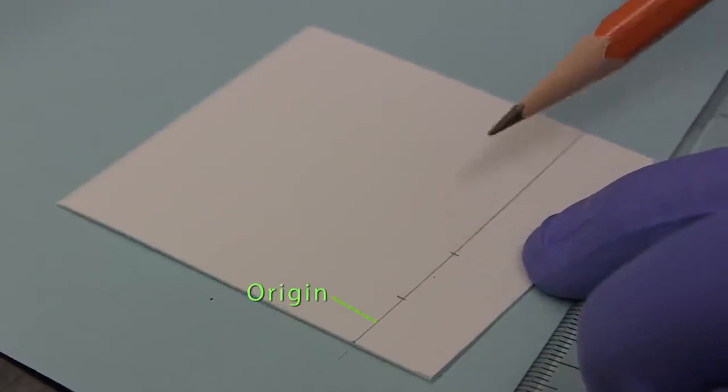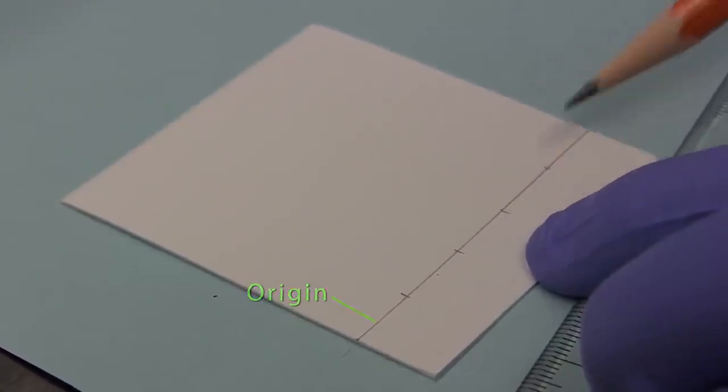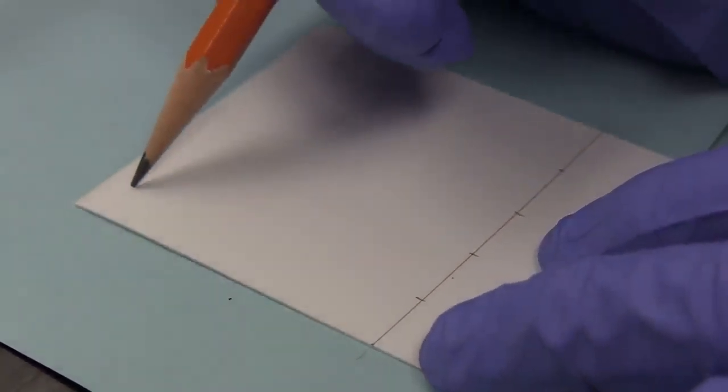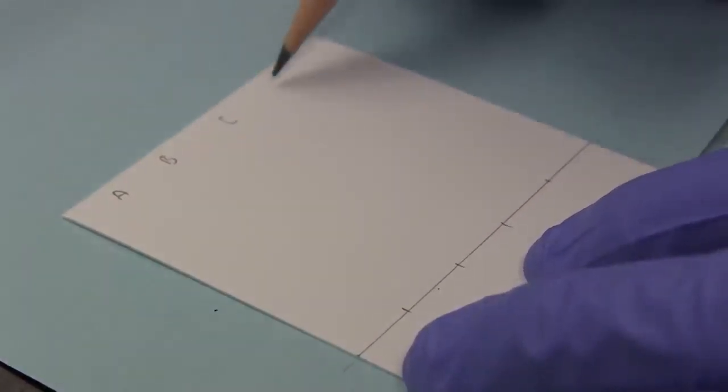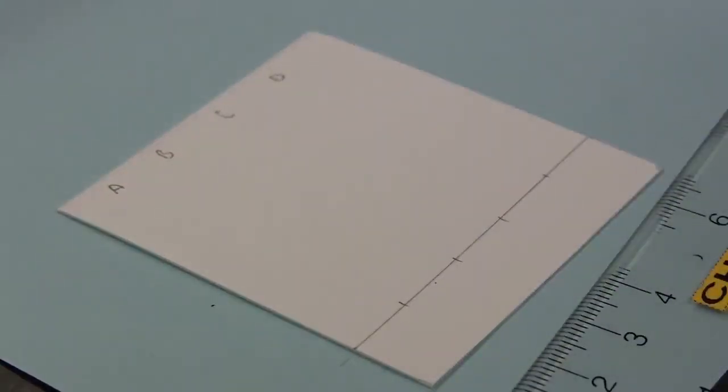Vertical markers are spaced about 1 centimeter apart along the origin. These markers are used as points of reference when applying mixtures and standards dissolved in a suitable solvent. And here we are going to run 4 lanes, lane A, B, C and D.